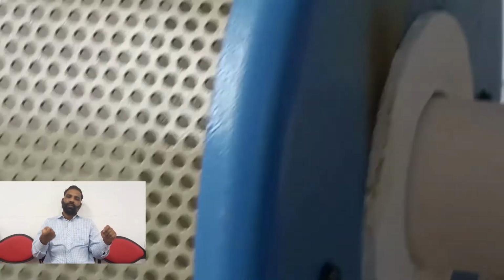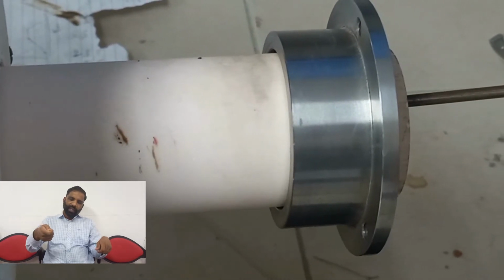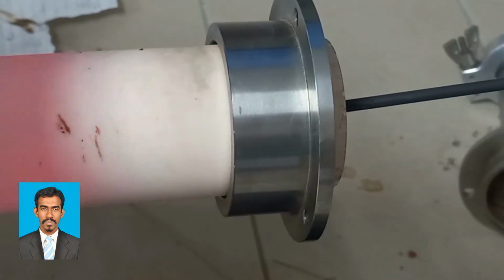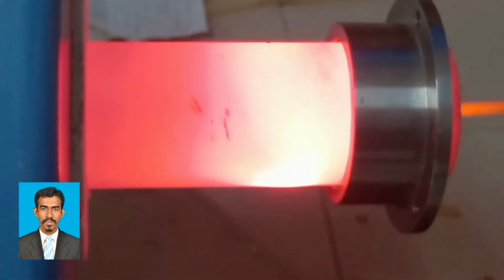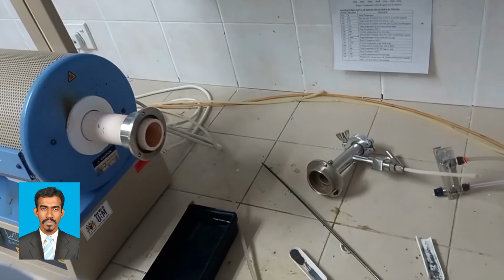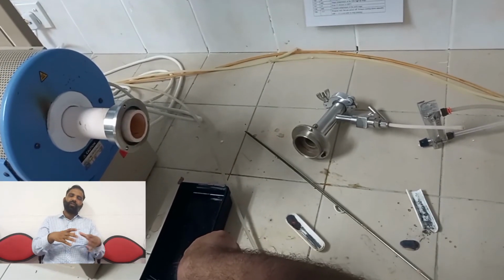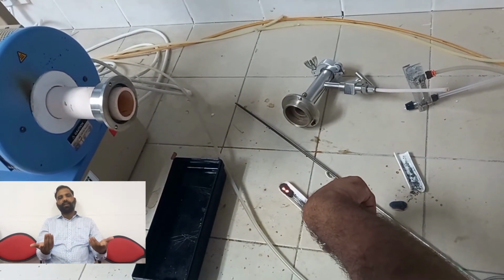Then you again open it, and for safety you use a tweezer. Put the wires into the water bath for the purpose of quenching, and this is the solution treatment.